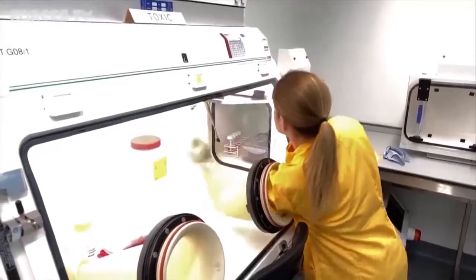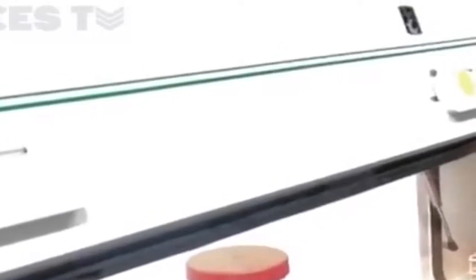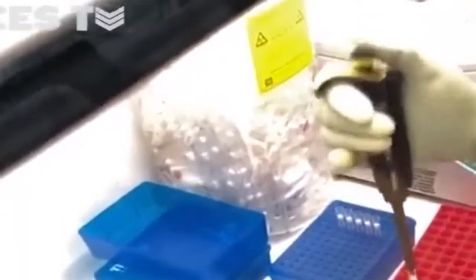DSTL's teams are searching for knowledge on the pathogen, and their findings are key to the nation moving through this pandemic. We're doing a variety of tests, but really they centre around characterising the virus itself and understanding how it behaves when it's aerosolised, how it behaves, for example, when it deposits on surfaces, how long does it survive, what's the effect of light, what's the effect of humidity. That sort of information is used, for example, in modelling that SAGE used to determine and advise what the government response will be going forwards.